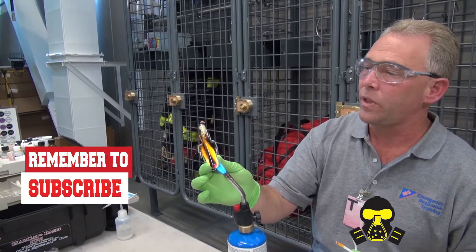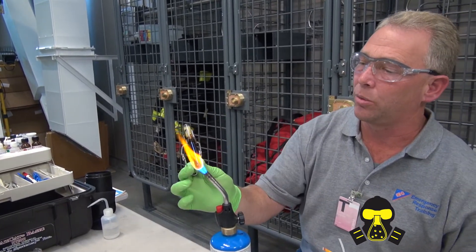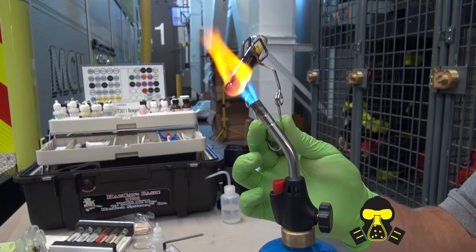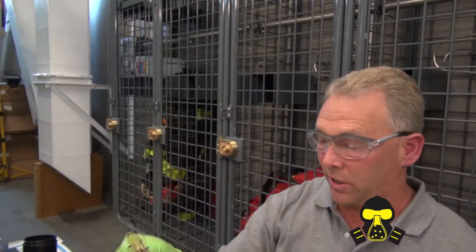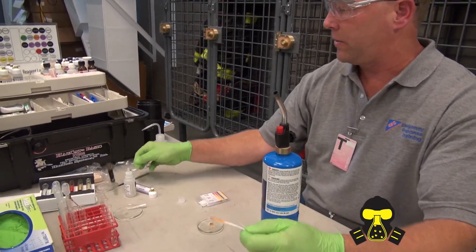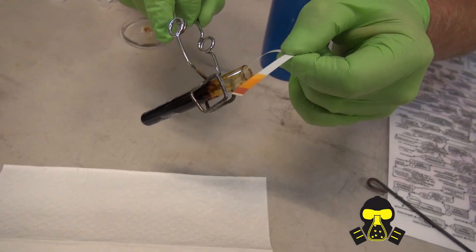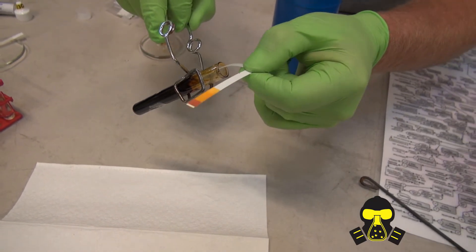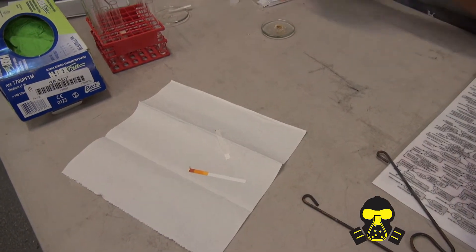We got some smoke going. This is probably something very simple. As we go through this, it's starting to get consumed. We want to go until we start making crack pipes — get this thing heated up. I got a little bit of a dimple in there, so it's definitely organic. It's a low pH. I've got to do my oxidizer test in the headspace. Trying not to get the sides touched because it looks gooey and brown. Now, this would go dark purple — those are both negative. I got low pH, negative oxidizer for thermal.